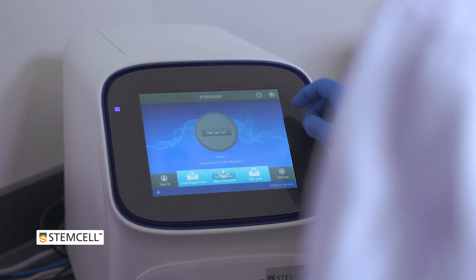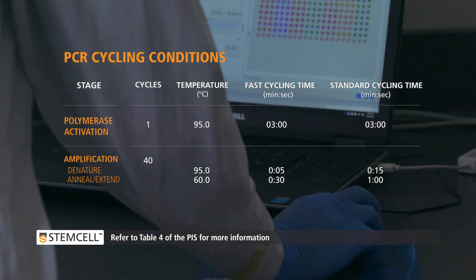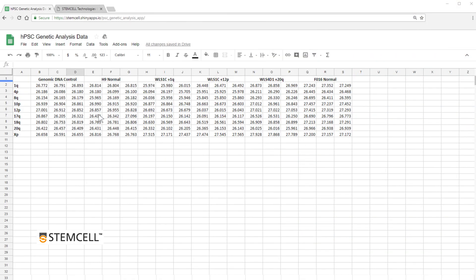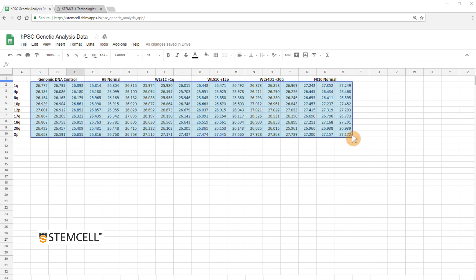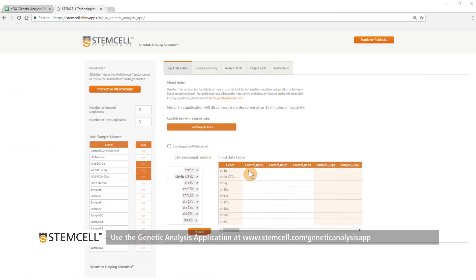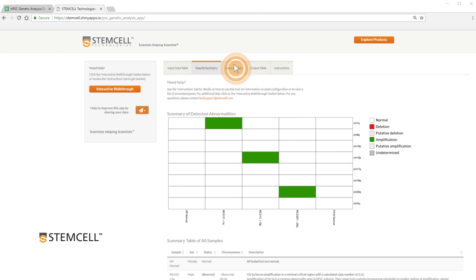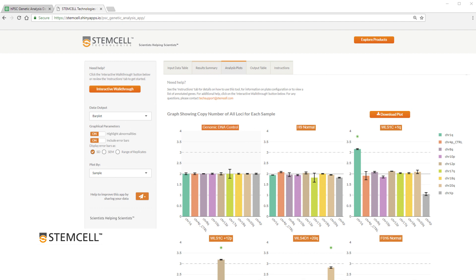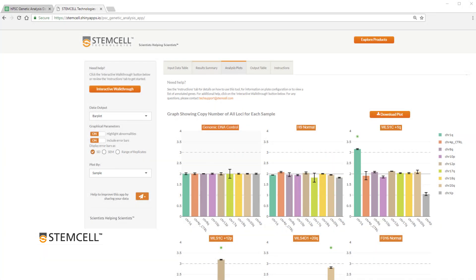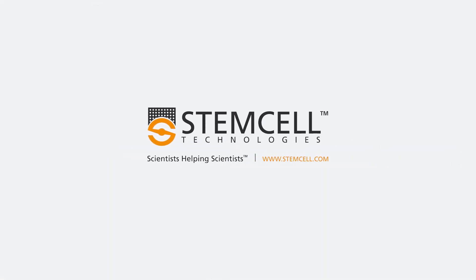The plate can now be placed in a quantitative PCR system and run using the following cycling conditions. The CT values obtained should be reorganized into the format shown, and can then be pasted directly into the online application found at stemcell.com. The online genomic analysis app can be used to easily interpret data, producing graphs as well as statistical analysis of each sample. If an abnormality is observed, the assay can be repeated to confirm or sent for further analysis using G-banding or other methods. For more information about this kit, please visit stemcell.com.